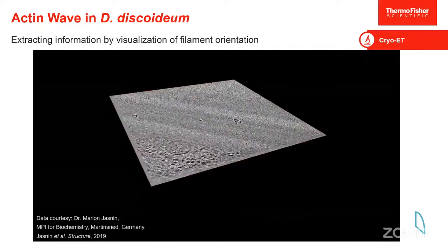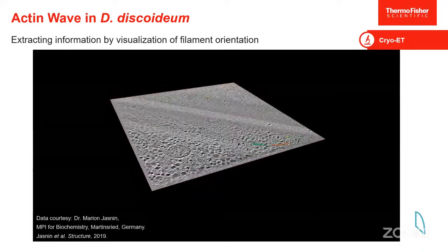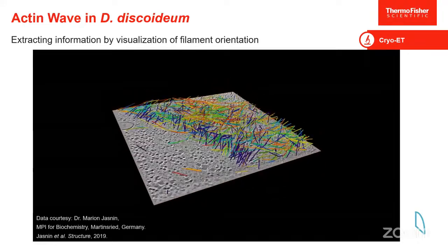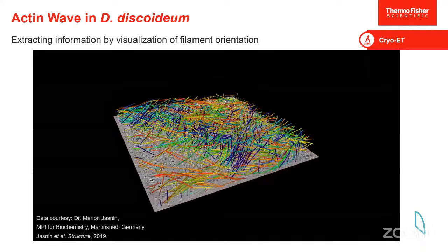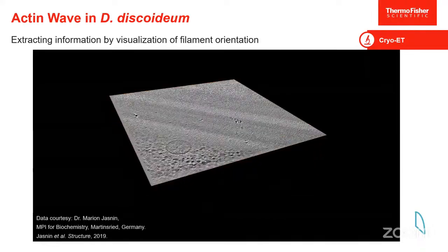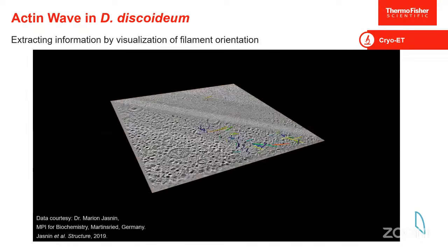One of the ways that we can do that would be with our, I believe it's called autoskeleton feature, where it counts that branch off as a new, I think they're called segments in our software. Each of these segments will end at a node, and some of the segments share a node, which is a branching point.